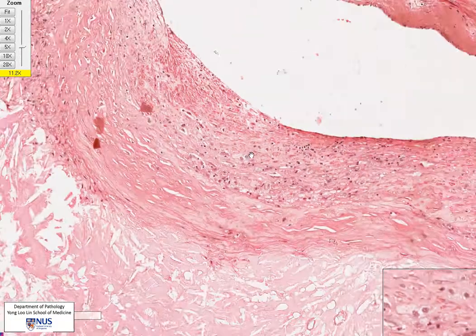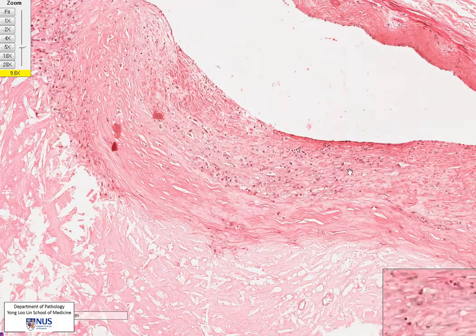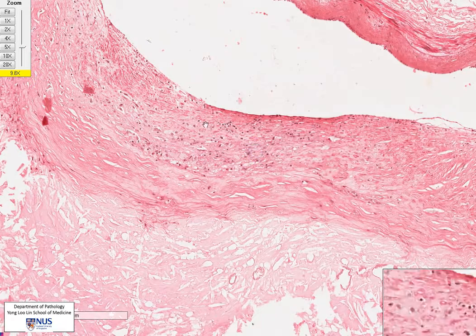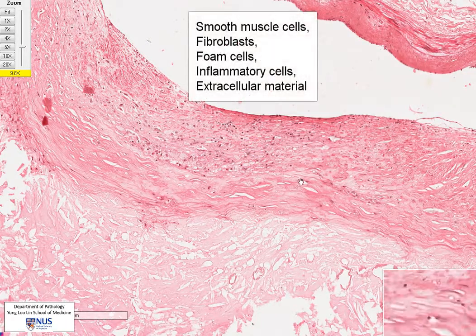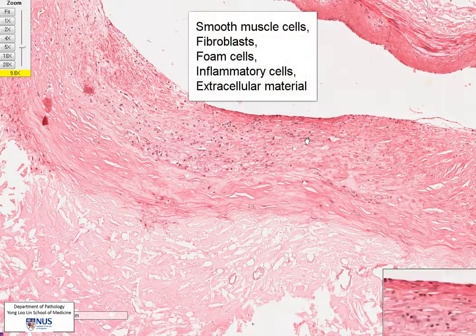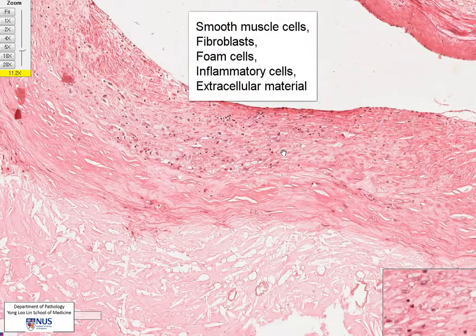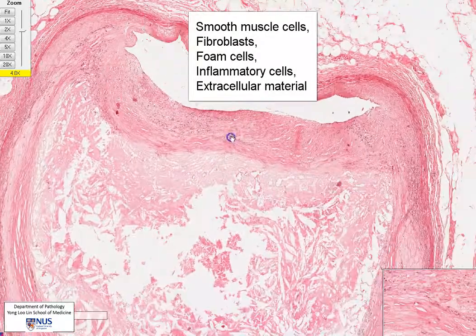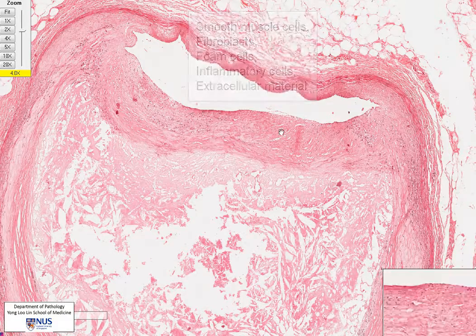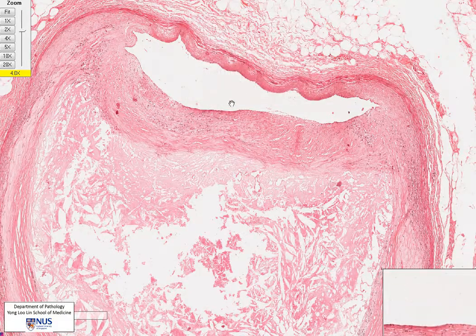These cells here — the smooth muscle cells, fibroblasts, and extracellular matrix, as well as the inflammatory cells — form the fibrous cap of the atheroma. What can happen is that sometimes the fibrous cap can rupture or ulcerate, precipitating thrombosis.